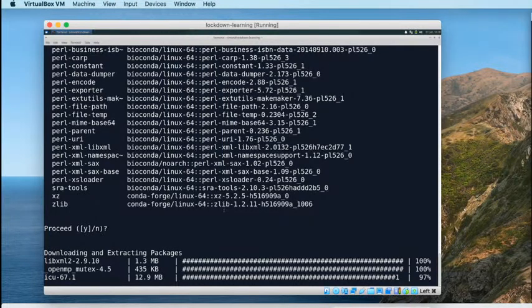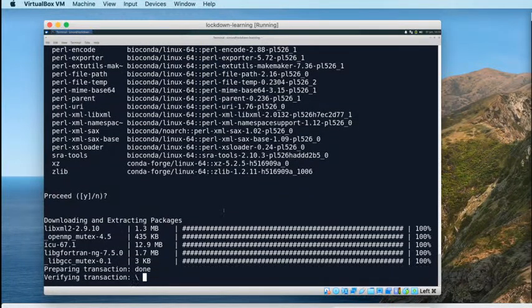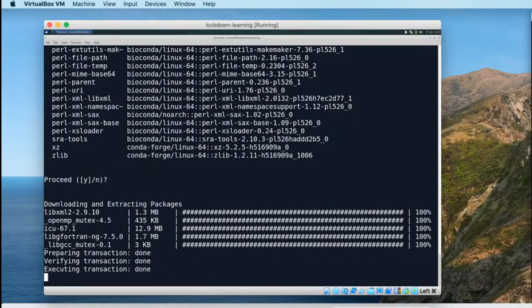I'm just going to download one sample, just by way of example today. So we're going to use prefetch in the way that we did with our RNA-Seq samples. We're going to use prefetch, and then we're going to use fastq-dump to turn it into fastq. So first things first, let's have a look at the data that we're going to download.